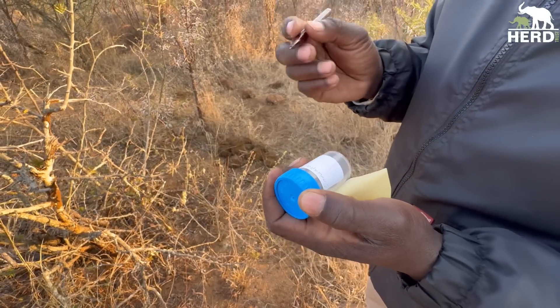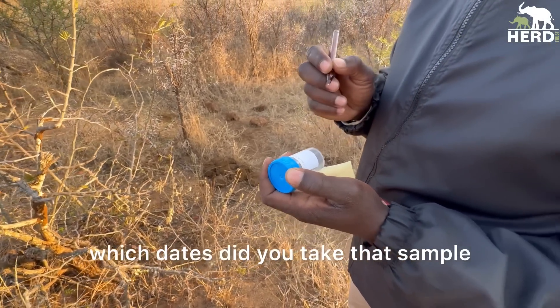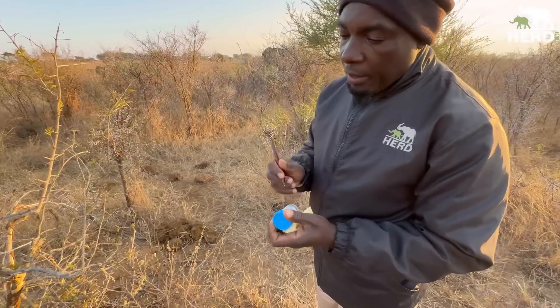I write the name and also the date, which is very important so that we can go through which dates we took care of that sample, and then the time.